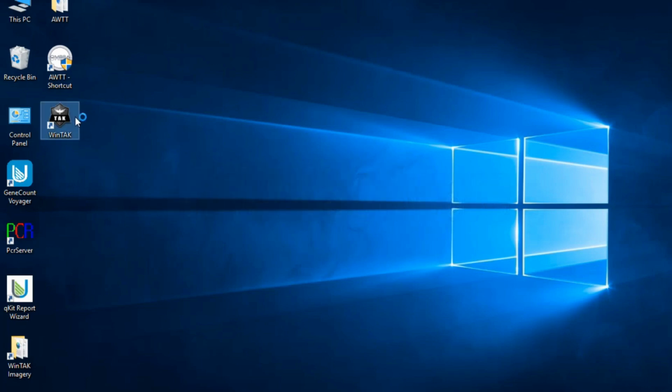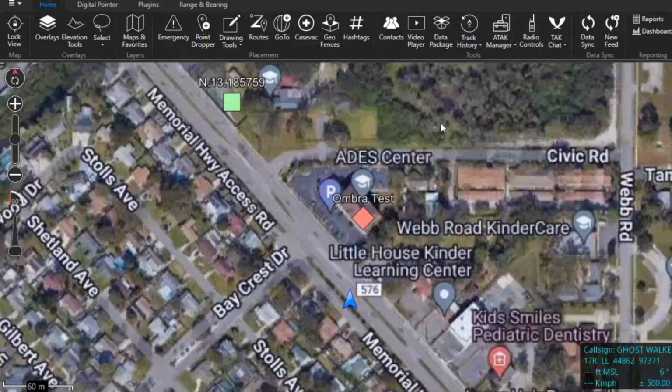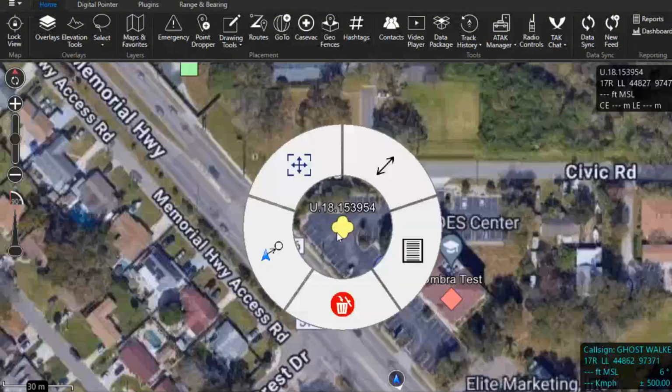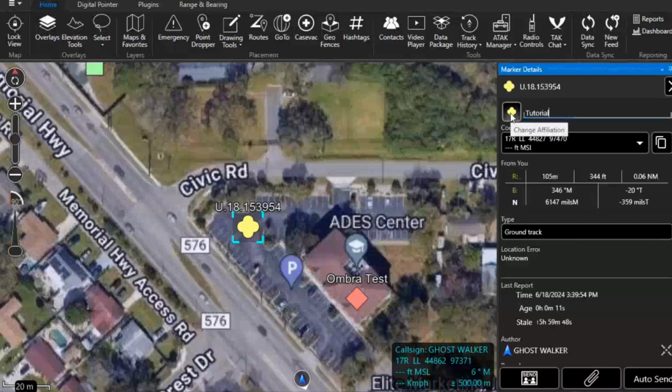This will bring up detailed mapping information for the user. You can select a marker, and on the right side of screen, specify information. In this case, you can label each location where you took samples with the name of the experiment performed. It will track the last reports.